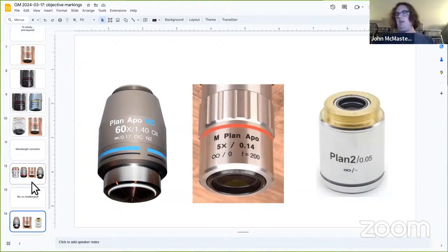And in a lot of biological applications, you want a cover slip. The issue is if you just try to look at some mushy biological system, you're going to have a very rough surface. You're going to have a meniscus on the water. You're going to have cells that are flopping all over the place. And it doesn't give you very good images. So typically in a biological system you'll mount it on a glass slide, and then you'll put a glass cover slip on to make a sandwich. And that sandwich really helps you get good images because now you have a very well-defined optical interface that can peer into that watery solution.